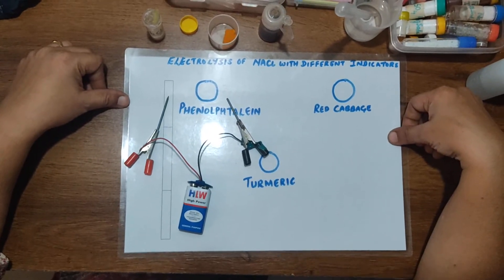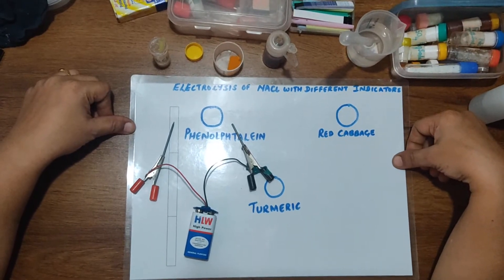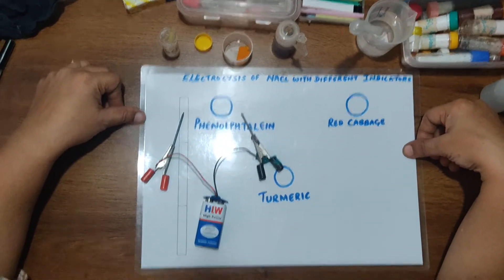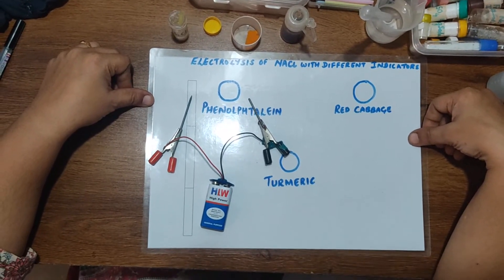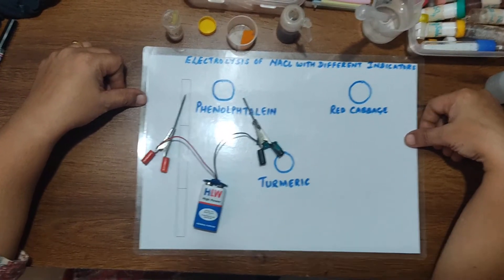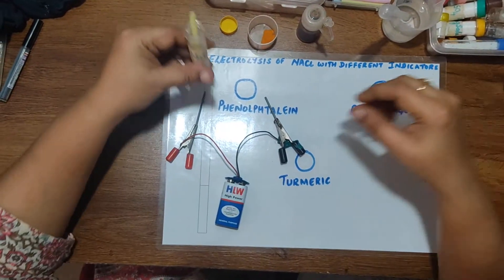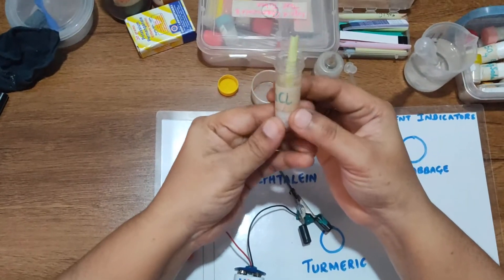Today I'm going to conduct a microscale experiment that is electrolysis of sodium chloride. I've used different indicators here: phenolphthalein, red cabbage which I freshly prepared, and turmeric which is naturally available in the kitchen. The materials required here is sodium chloride or common salt.